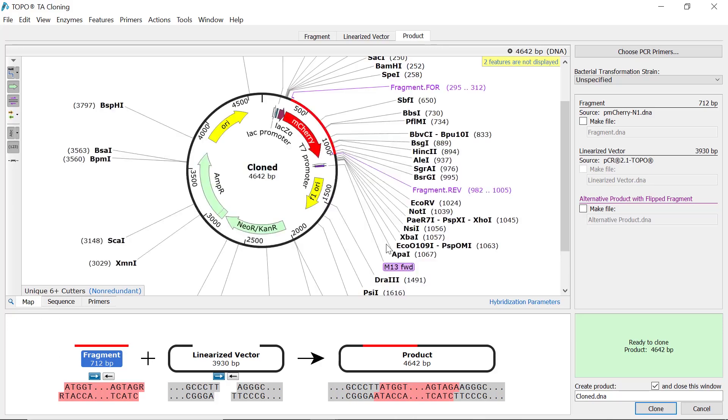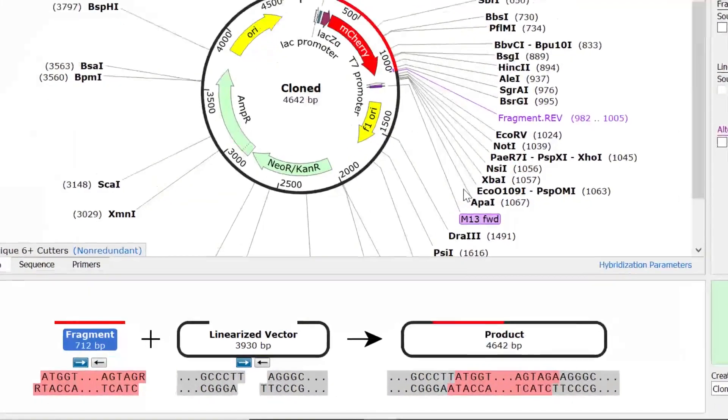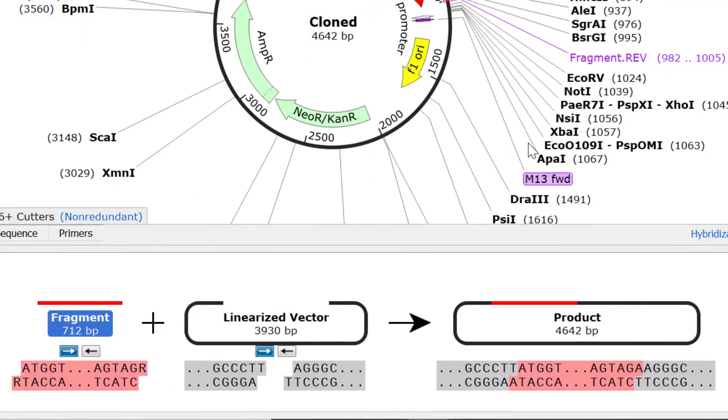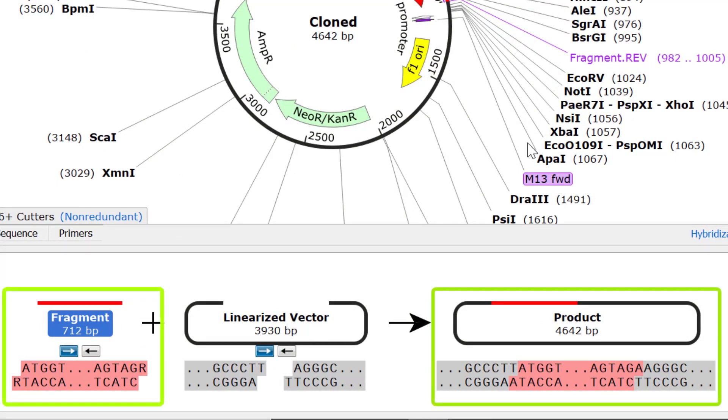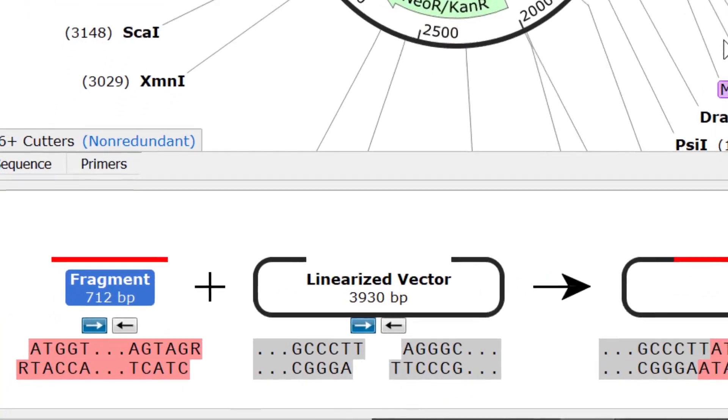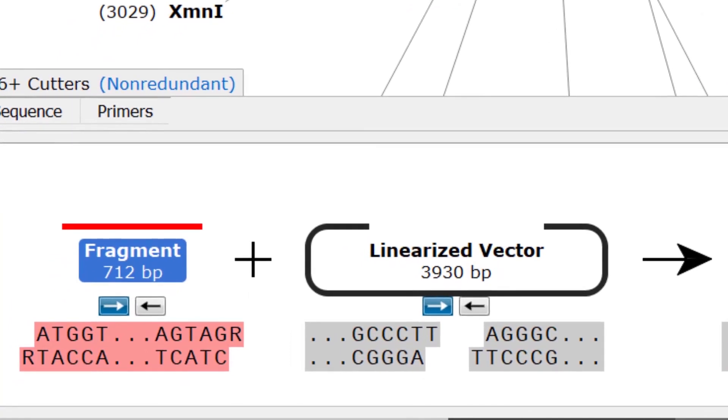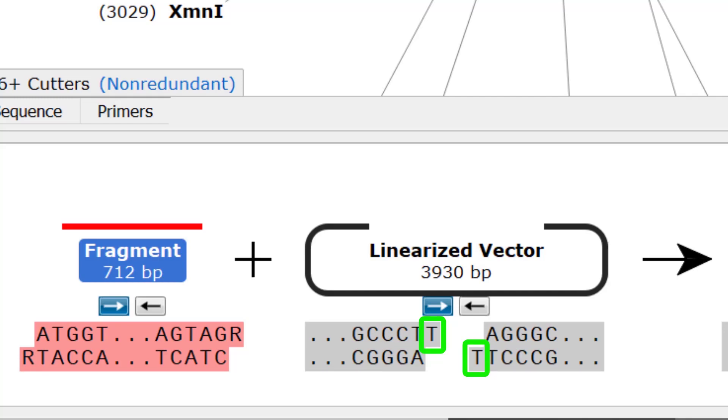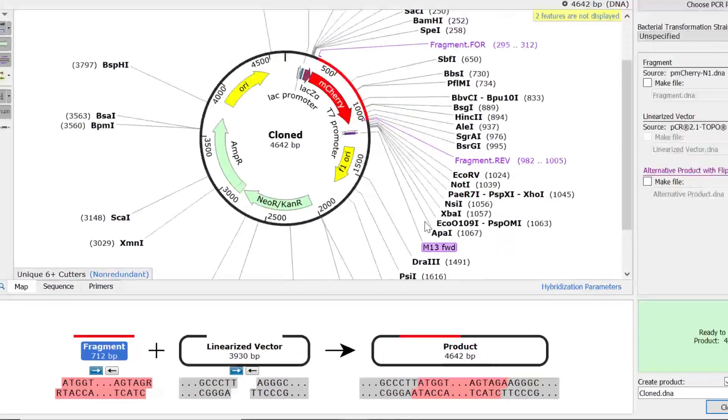Now let's look at the output for topo TA cloning. In the preview window at the bottom, you will see the populated fragment and product sequences. Since TA topo cloning uses Taq polymerase with template independent terminal transferase activity, a 3' adenine overhang will be added to the fragment. This overhang binds with the thymine overhang present on the linearized vector, without the need for DNA ligase.